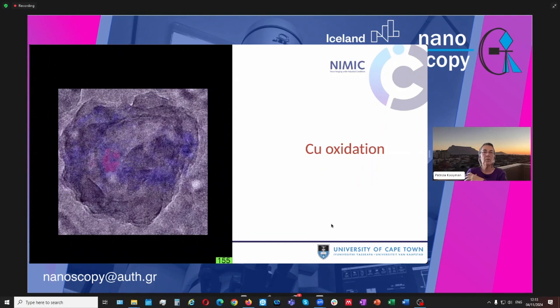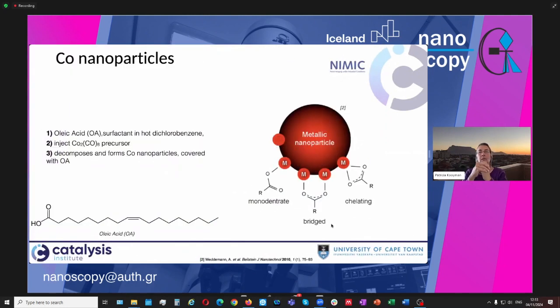So that's one example. Another example is work on cobalt nanoparticles that PhD student Marien Bremmer did. This is one of the collaborations with Oslo, with Anja Sjastad there. Oh, I see that the original reference is missing, that's not nice. I'm sorry about that. There's supposed to be a reference here to the paper of Irini Sakariki and Anja Sjastad that describes how these particles are being prepared.